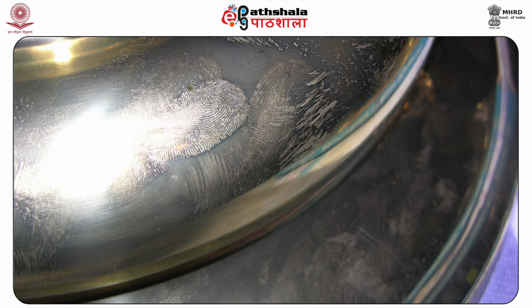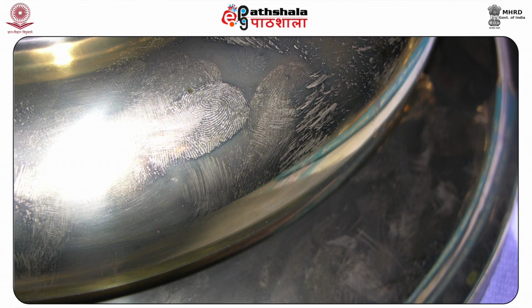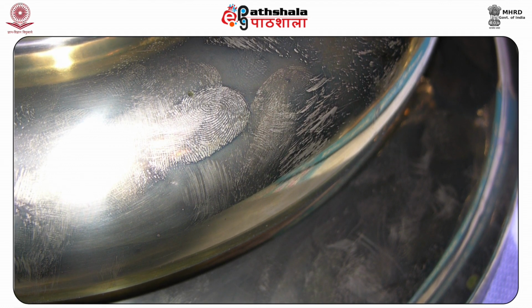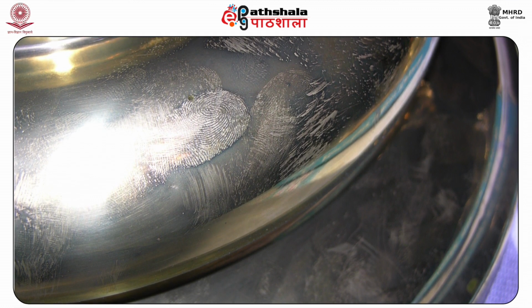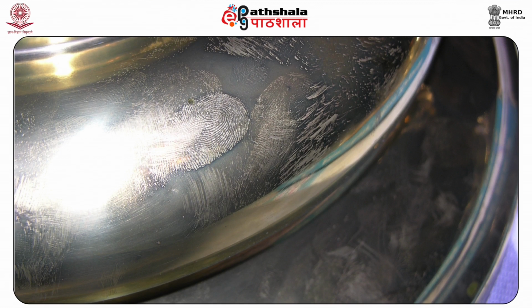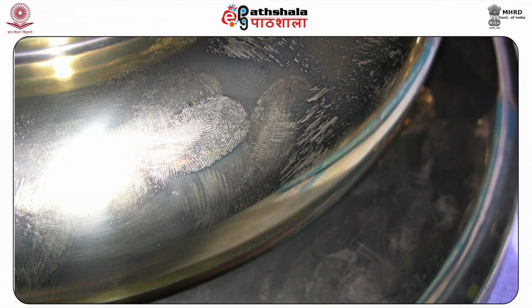However, if the concentration of metallic silver increases beyond a limit, the particles coalesce and precipitate out. The colloidal nature of silver particles is lost and the quality of developed fingerprints is lowered.